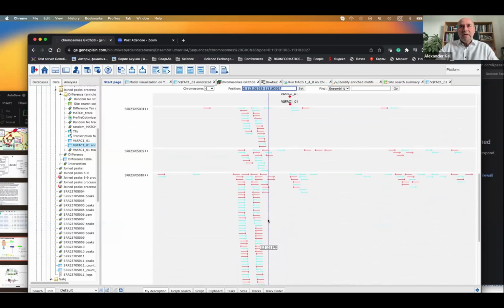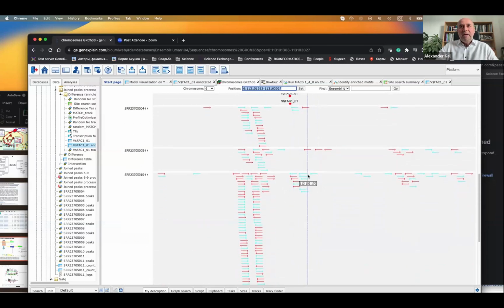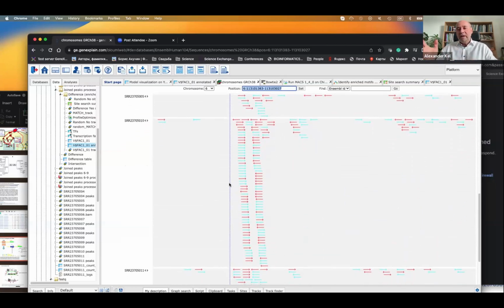The real peak of the reads is a little bit left of that area of the factor binding, and a little bit right. So you see these factors, by binding in that area, in fact occupy the place, and it doesn't allow this restriction enzyme to cut.